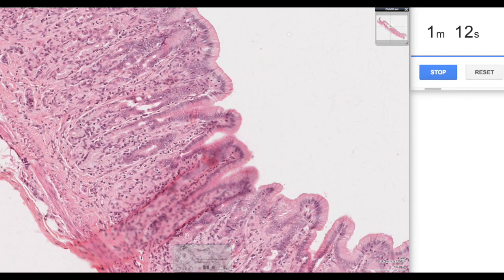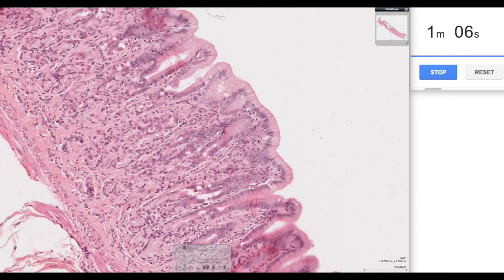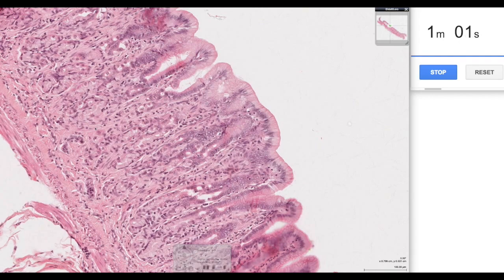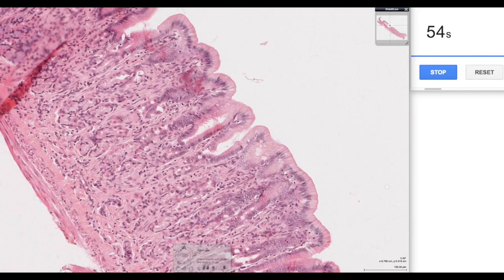We also see down at the base some evidence of other cell types called chief cells, which are responsible for the secretion of the inactive form of pepsin, known as pepsinogen. Here we have more complex-looking glands with less lamina propria in between them, so now we're in what we call the body or the fundus of the stomach.